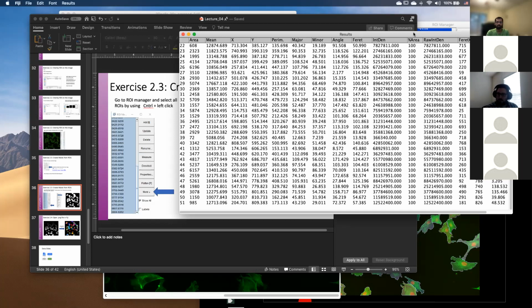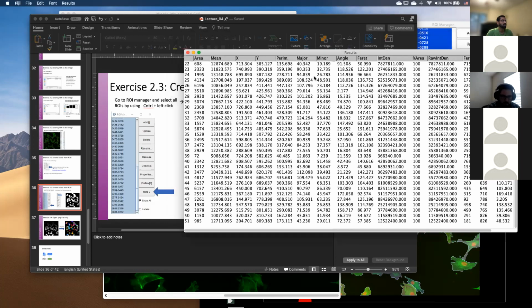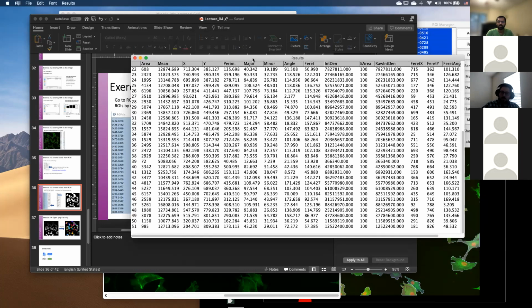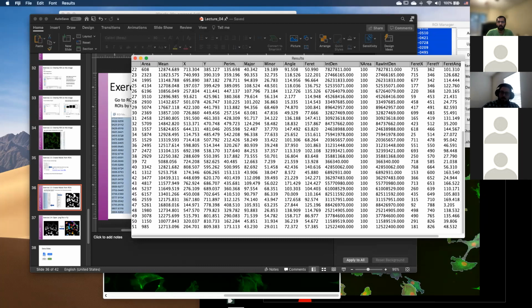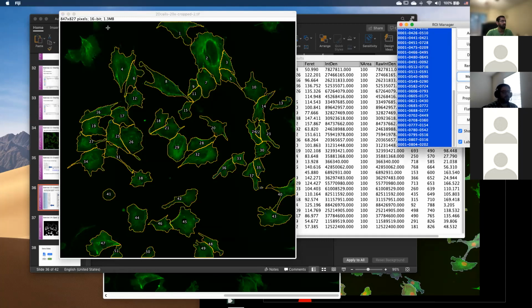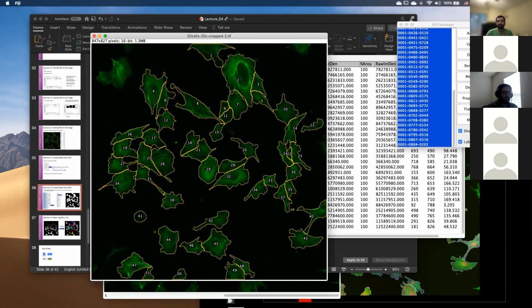So I don't know why my Fiji keeps giving me reverted colors. I can get the ROI okay, but it's just black outlines. I can create a new image with a white background and then everything works, but with the black background, I can't. So the outlines of your ROI have black color. Is that what you are saying? Yeah. So I try to create the new image, like what you show, and it won't work because the ROIs are all black outlined. But if I do a white background, then it works.